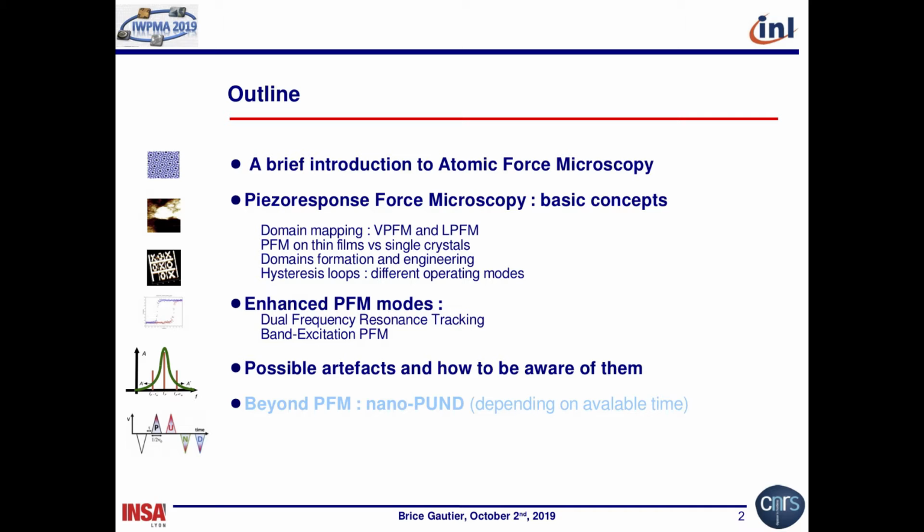So then we will describe the piezoresponse force microscopy, the vertical PFM, the lateral PFM. We'll make a distinction between the single crystals and the thin films. It's not exactly the same way to measure. I will talk about the domain, ferroelectric domain formation and engineering, and show you what PFM can do to study those phenomena.